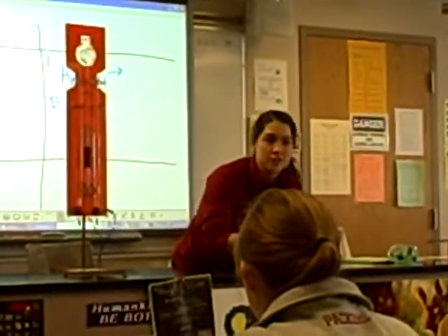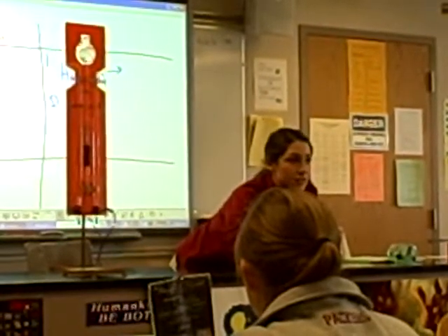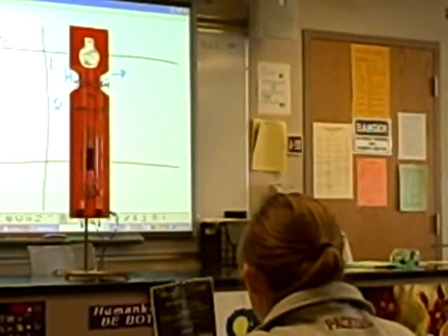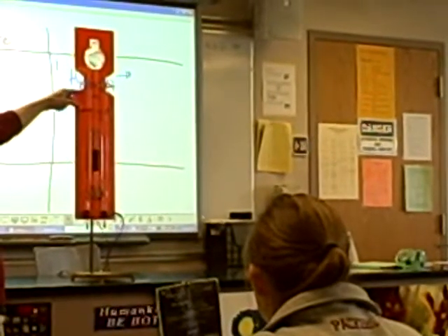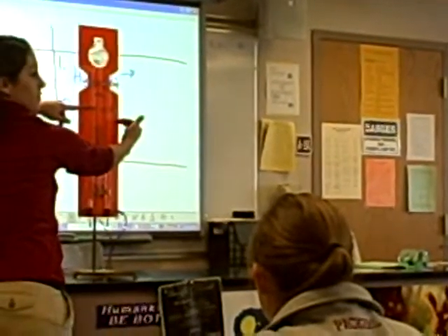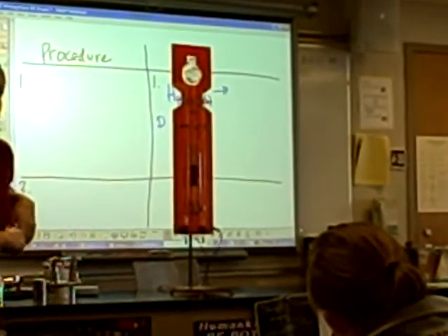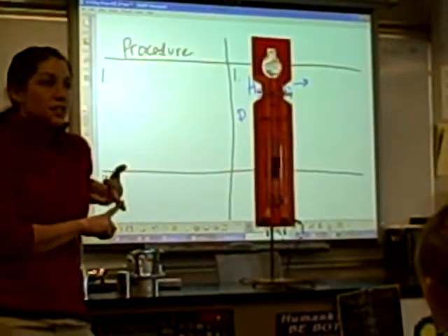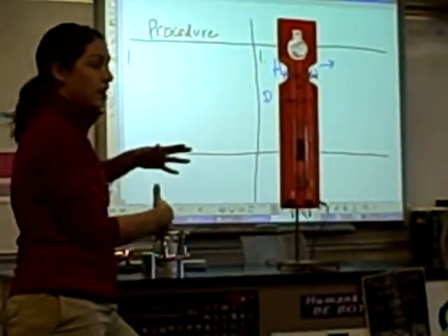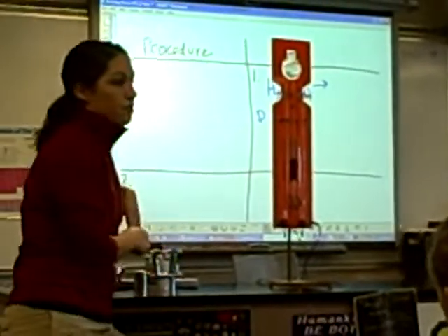There are bubbles. Okay, so John just made a good observation. He said the liquid level is lowering. Do you guys see that? This one is at right here. They both started up way up here. So this one's here. This one's here. Okay. What two gases do you think are being made? Hydrogen and oxygen. Because of their charges, and electricity has charges, right? They get separated. One goes in one column, one goes in the other.